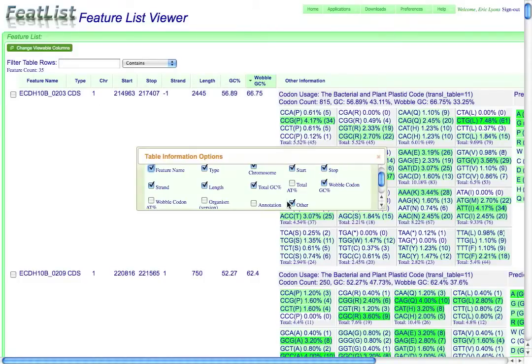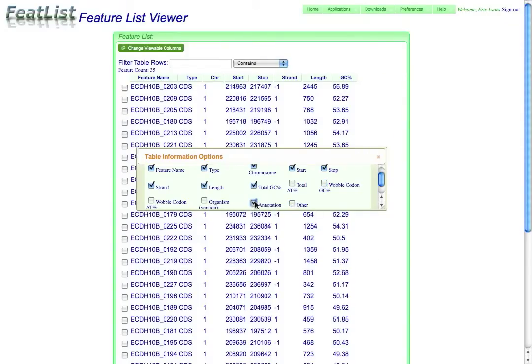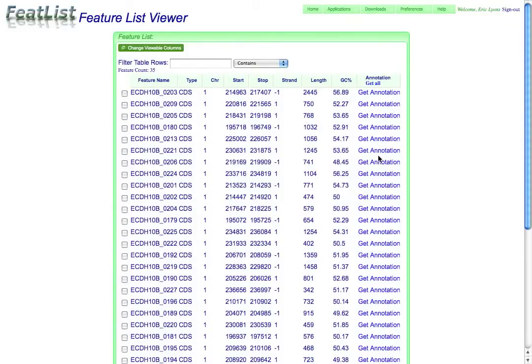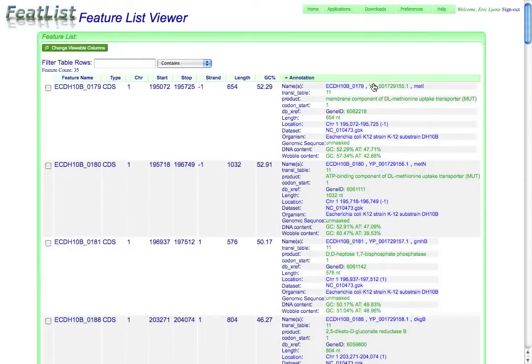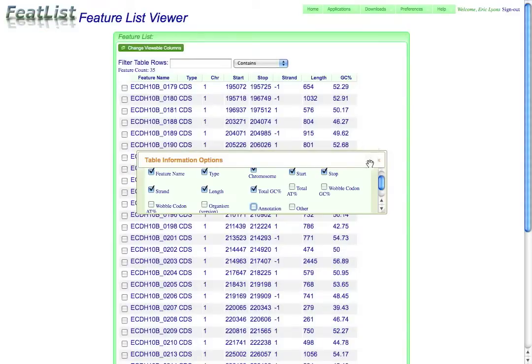I'm going to now hide those, as well as the wobble GC content. And if I was interested in the annotations, I could select those and just say go get me all the annotations, and the system will go out to the database and grab all the annotations for each one of these features. I'm going to hide those for the time being.